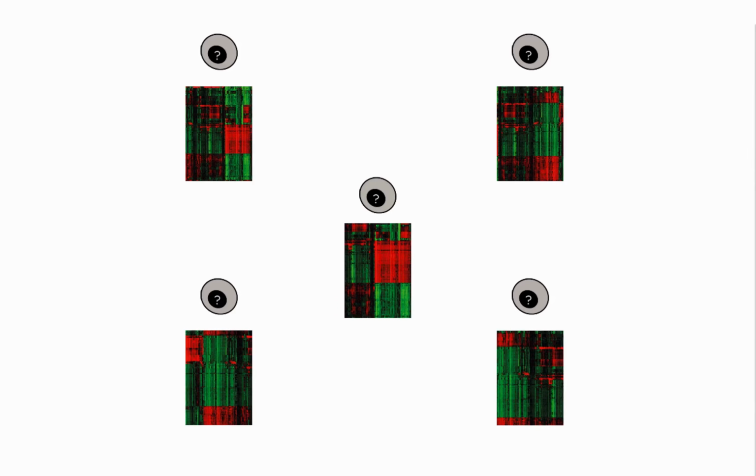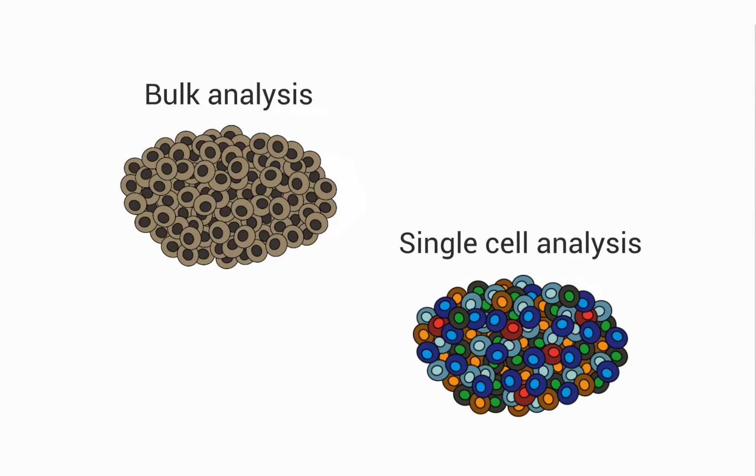This gives us a lot of information about the properties and characteristics of the cells, the fingerprint we've been talking about. With that, we are able to reconstruct the tumor architecture and get an incredibly detailed picture of the tumor's composition. The possibilities of data analysis are endless and include unraveling complex cell populations, reconstructing developmental trajectories, and modeling transcriptional dynamics. To discuss all the different analytic possibilities would be way beyond the scope of this video.